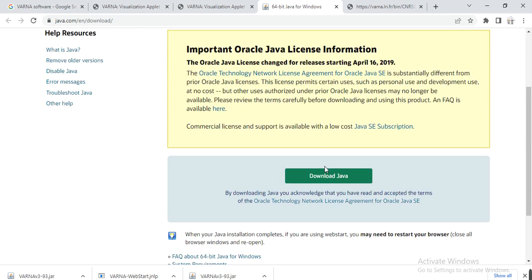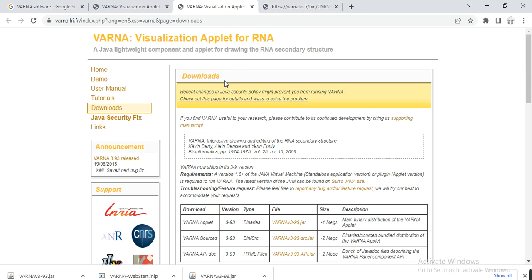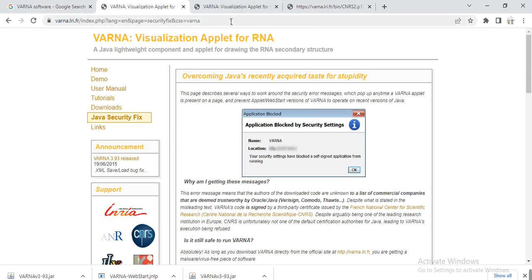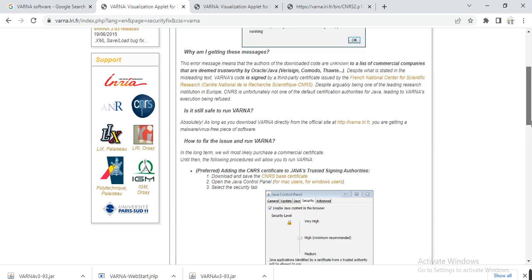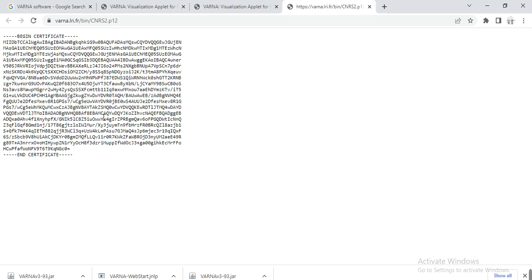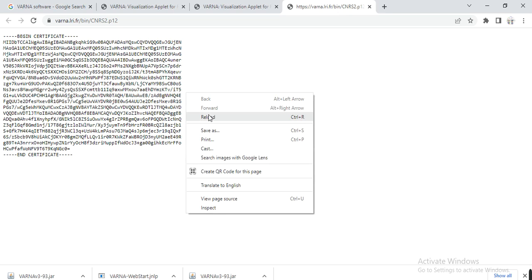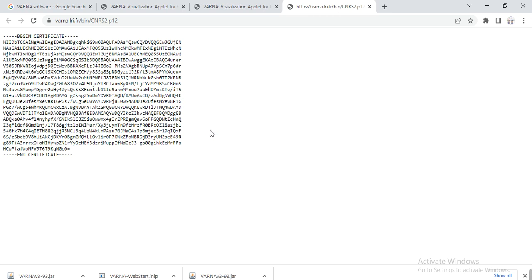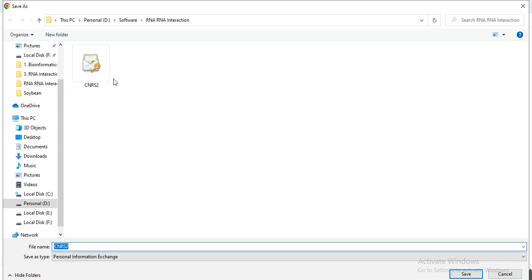Because this software only runs with the support of Java. When you have downloaded it, here in the requirements you need to download this certificate. Here this type of certificate appears. You can save it — right-click and then save it, then save it to your destination folder. As I have already downloaded it, then you can save it.